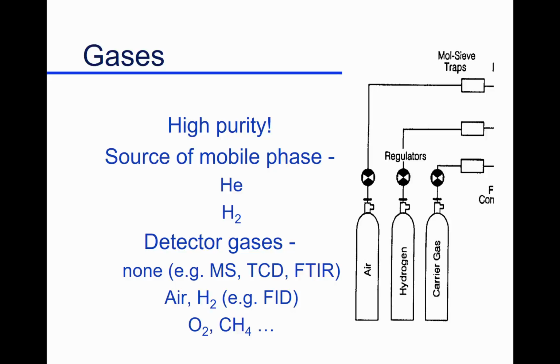So let's look at our gases. They have to be high purity, but not outrageously high purity. I was consulting for a food company one time, and they were buying helium that was clean to I think the 6th or 7th decimal place. And boy, were they paying money for that, several hundred dollars per cylinder, over $1,000 actually. I looked at them and said, I don't think you need that. I think something like a $100 tank will do you. But they have to be high purity.